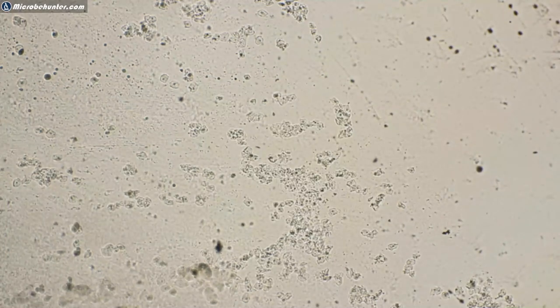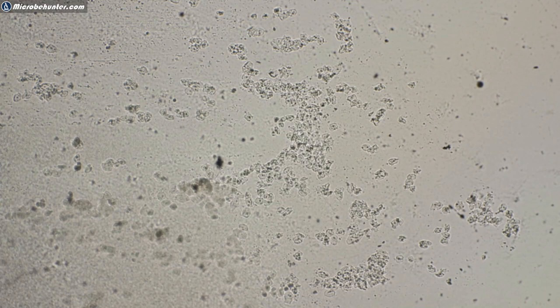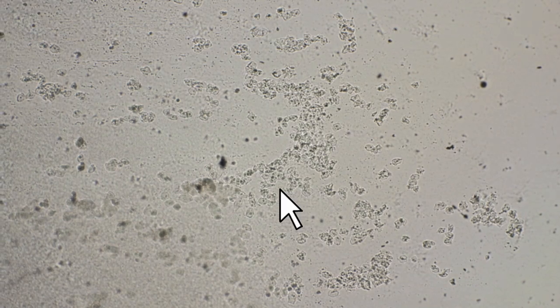I need to pull out the prism as well. Oh, what a mess. Okay. Lots of cells here. But it doesn't look very nice because there is no water around it. So you don't see anything because, again, it is too bright. Here we go, okay? It doesn't look like anything, but all of these things here, these are all cells.